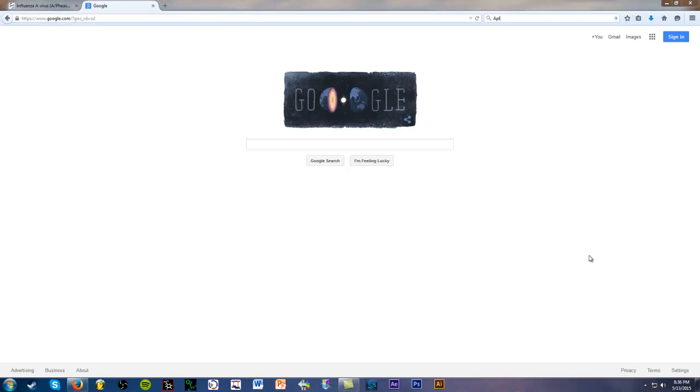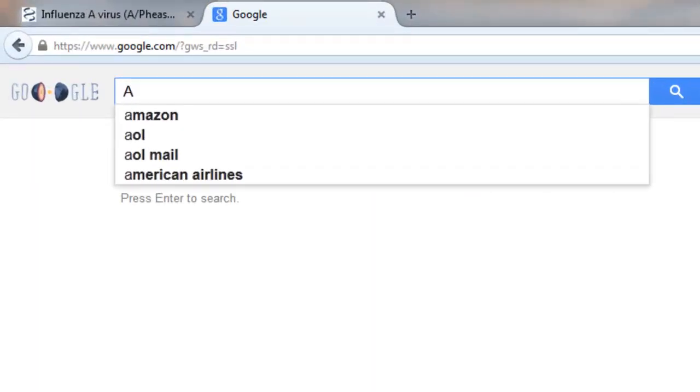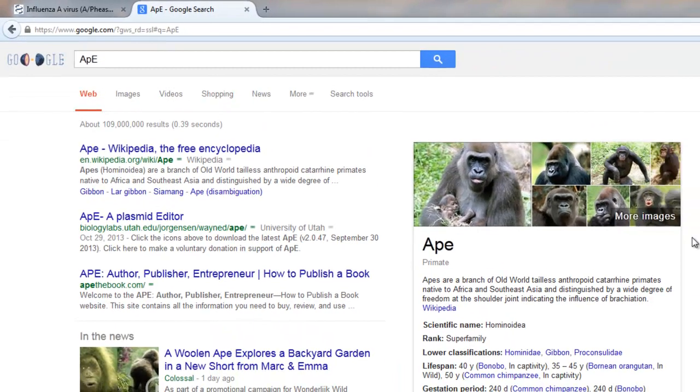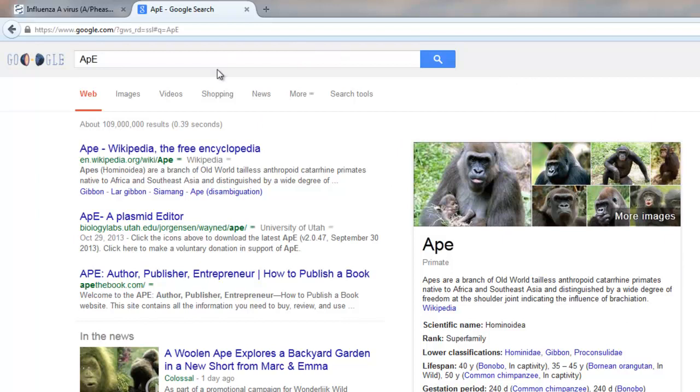Okay, so let's go ahead and open up Google and simply type in APE. That's what I'm going to do. A-P-E. There we go, and we're going to just search that, and we get some pictures of apes. Well, this is not what we really want, and it's actually the second link right here, APE A Plasmid Editor.